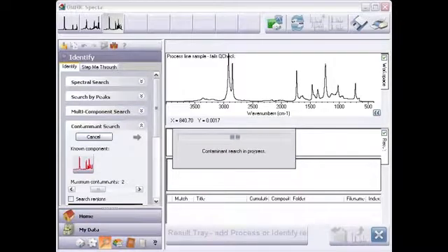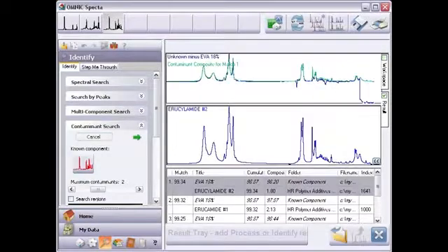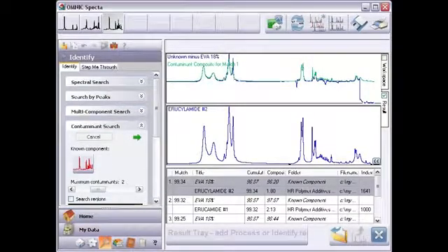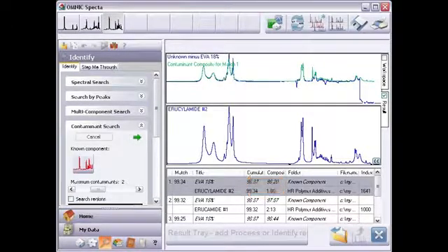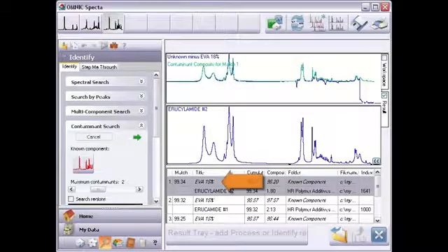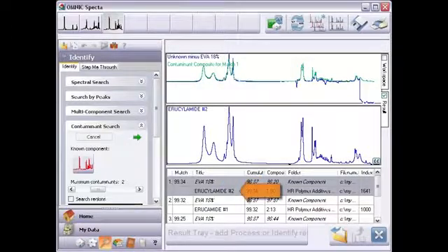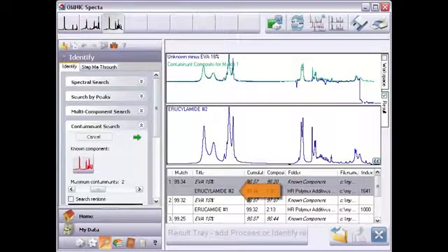The search results appear in the result pane. Each match is a set of two spectra. The best match is listed first. The first component, listed in italic text, is the 18% EVA reference. The second component is the contaminant.